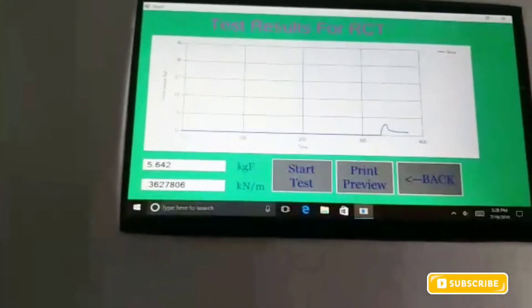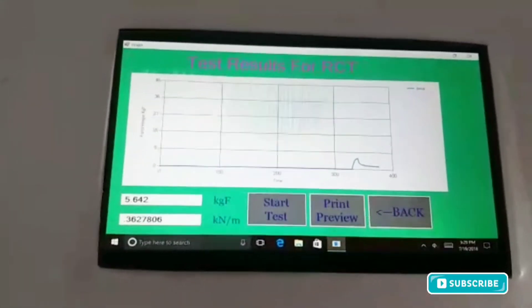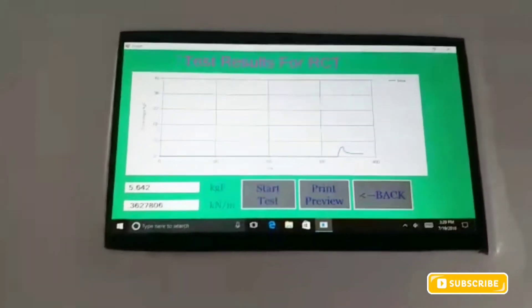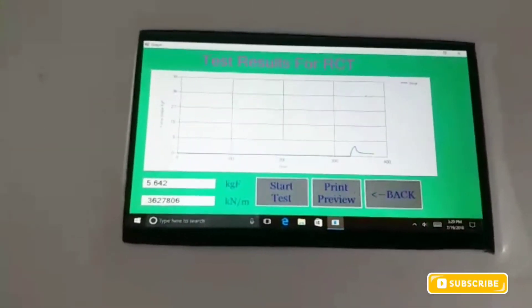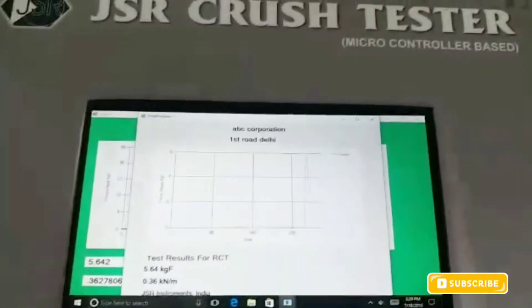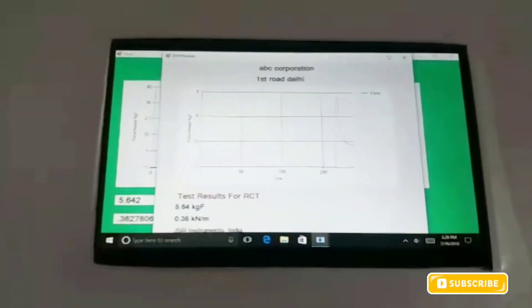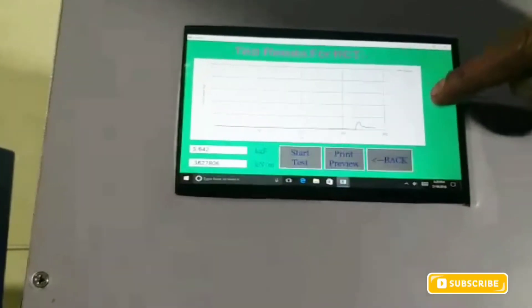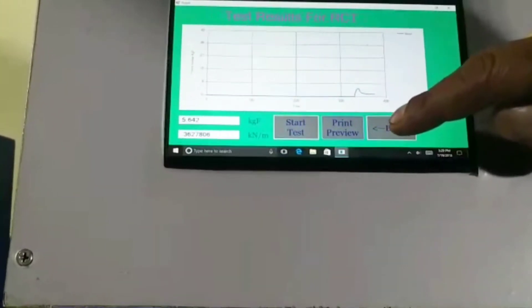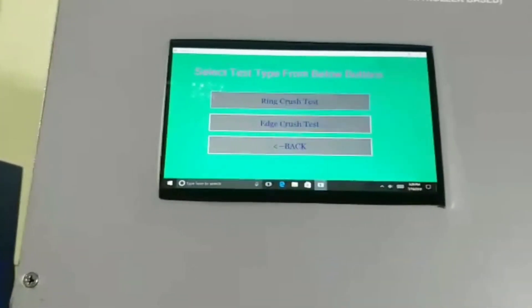As soon as the ring is pressed, we receive the result on the screen. The value is 5.642 in KGF and Kilonewton. By this procedure, we can take the printout. This is the print preview — we can go to the printer here, then make it escape, and go back for taking another test. This is the way by which we can take the ring crush test.